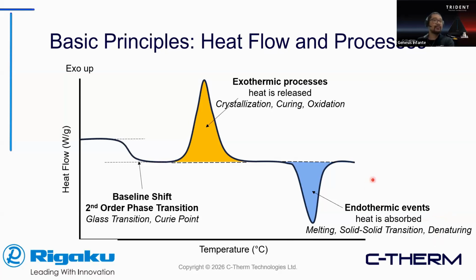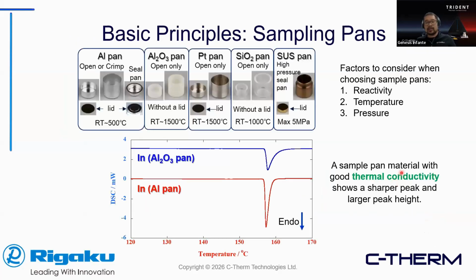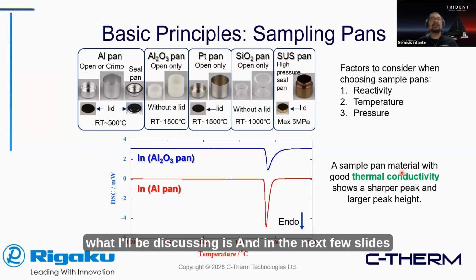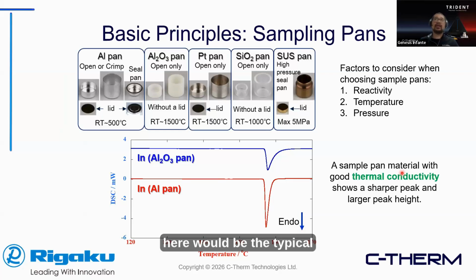So now, after covering the basics of DSC as a concept in general, what I'll be discussing in the next few slides would be the typical approach when it comes to having good experimental parameters.